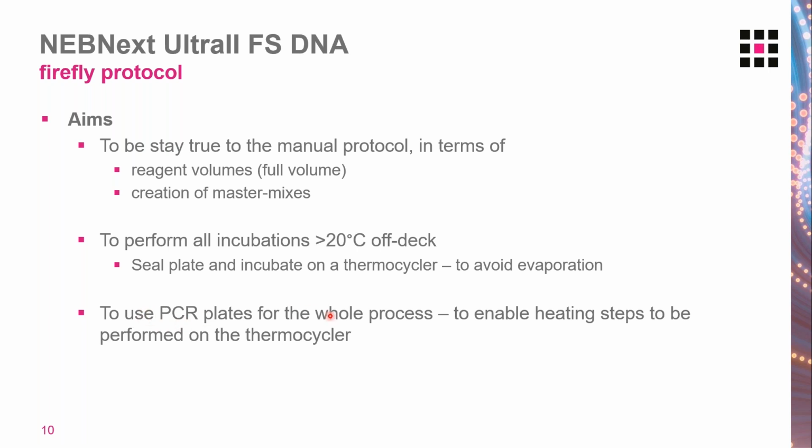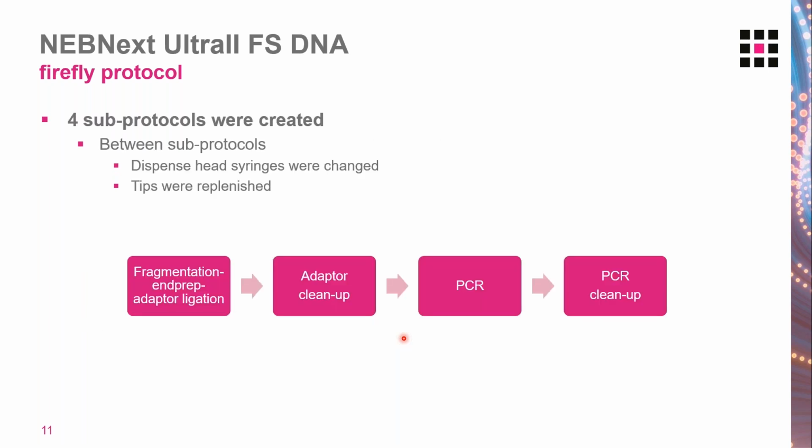The whole process was conducted in PCR plates because we wanted to do all heating steps on a thermocycler. In this way, we prepared 4 sub-protocols for this NEBNext Ultra II FS DNA library prep.